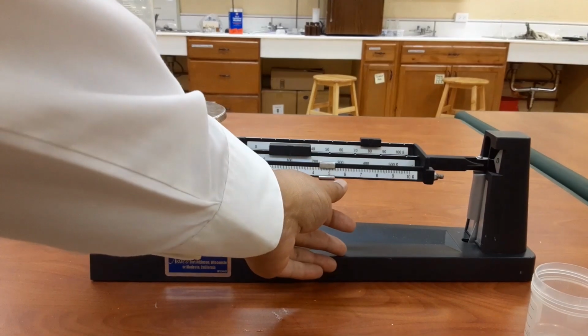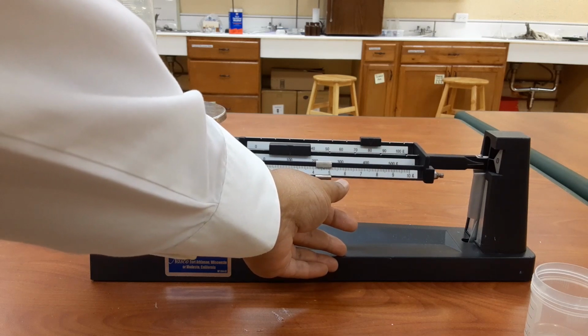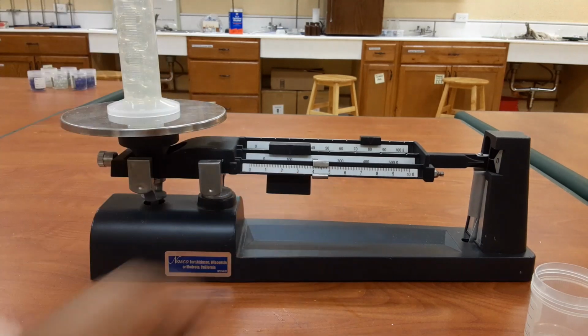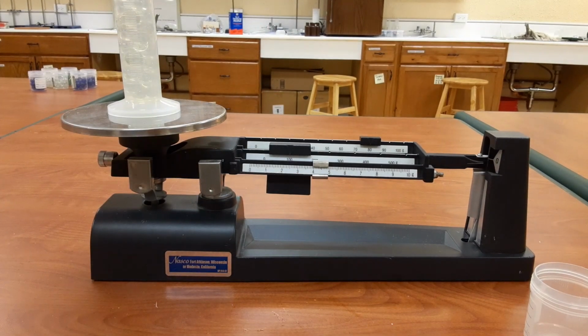At 180, and the smallest beam is reading 4.5. So the new mass I have is 184.5 grams. So subtract from this mass the mass of the graduated cylinder with just the water in it, and you'll be able to get the mass of the marbles. And after you have the mass of the marbles, divide the mass of the marbles by the volume of the marbles, and that will give you the density of the marbles. So I hope that you enjoyed doing this lab.